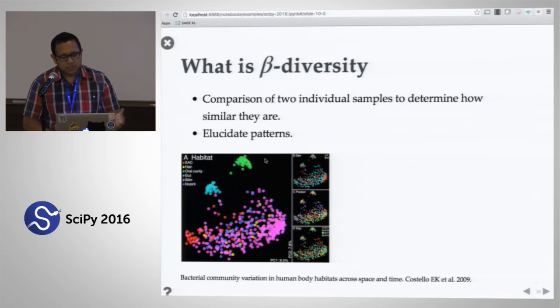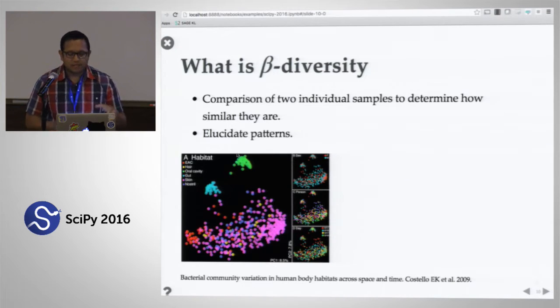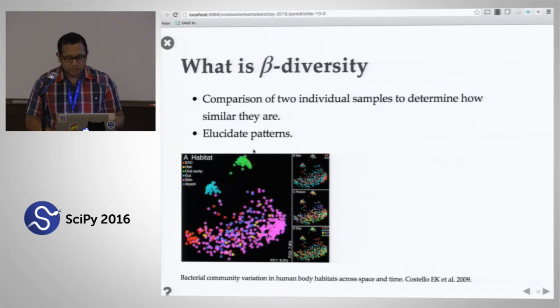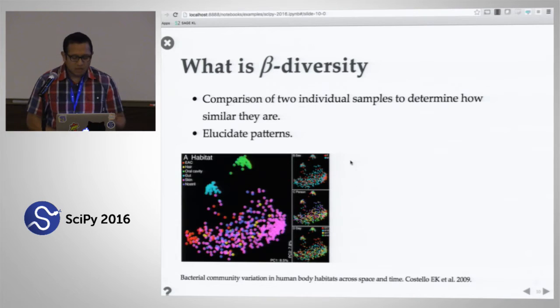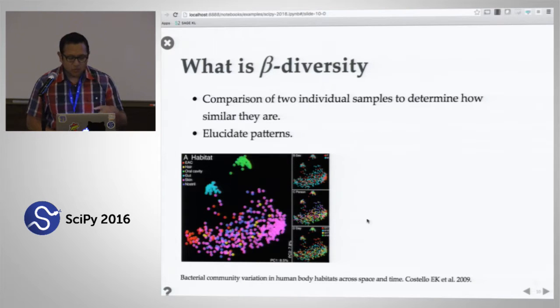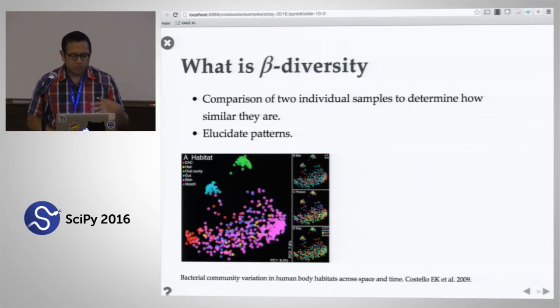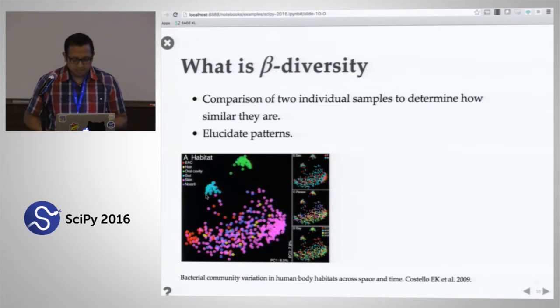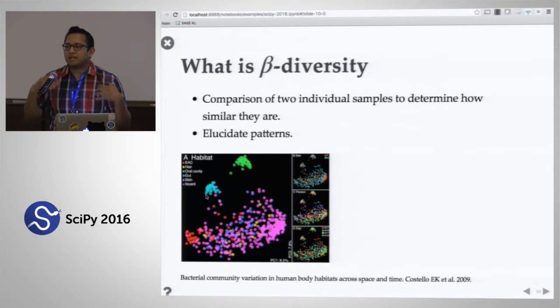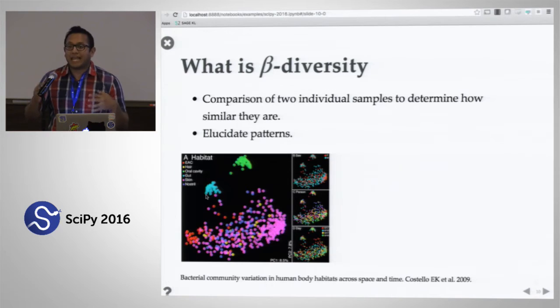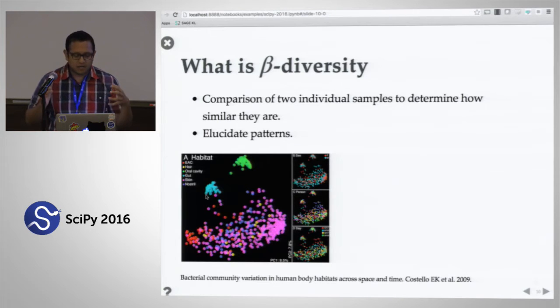For example, body habitat has a really strong effect on the differences between communities, but something like sex or the subject that donated the sample are not nearly as big a difference when you compare it to body habitat. So Emperor is exactly that — Emperor will allow you to visualize these matrices and interact with and use the metadata within your ordination.